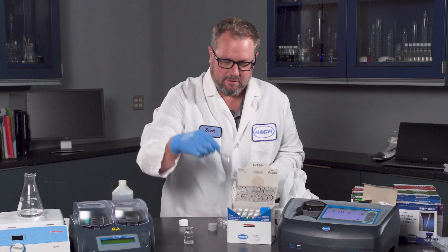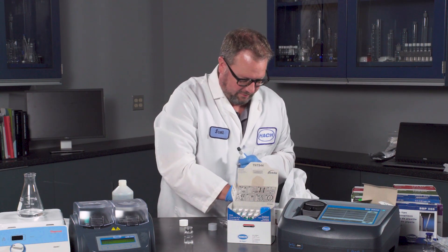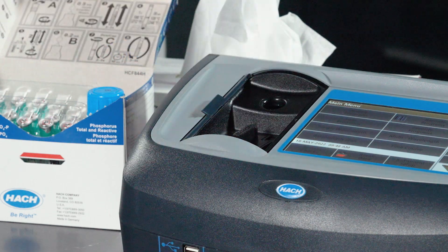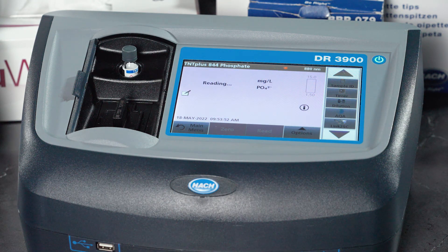And then with the TNT Plus — let's go back to the main menu. The nice thing about the TNT Plus is you just drop it in and it's going to read the barcode and pull up the correct method, and we get the result.